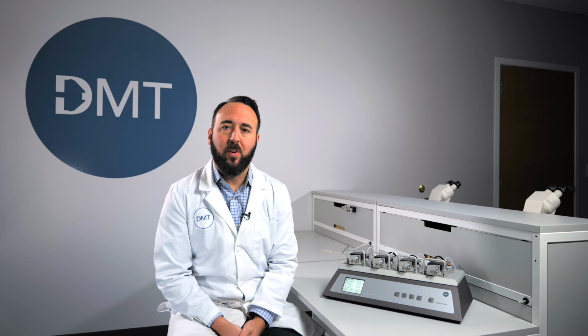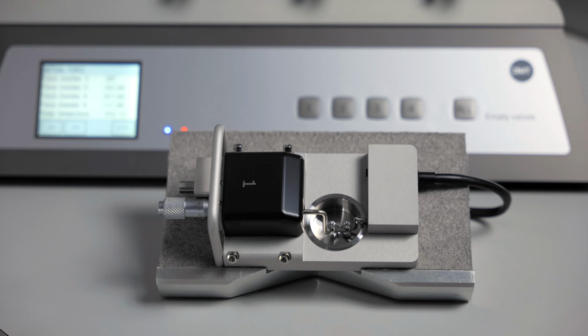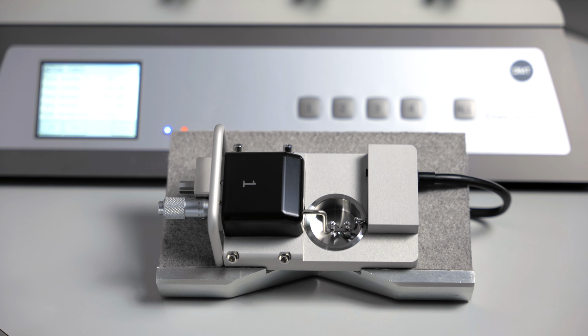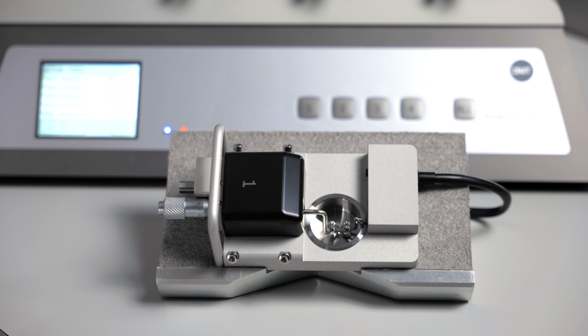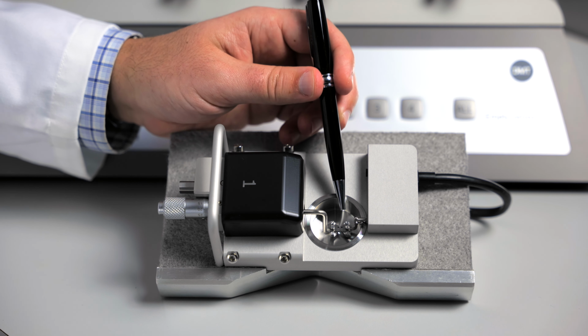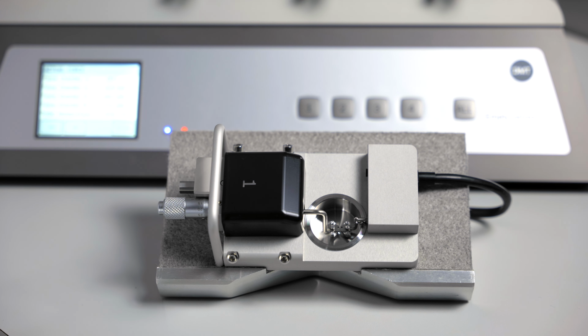It has the buttons on front for emptying the buffer in your chambers, as well as the touchscreen to control your temperature, perform your force calibrations, or change the sensitivity of the transducers. Each chamber has 2 mounts to which you will attach your tissue. One mount is connected to a micropositioner that will be used to stretch your tissue. The other mount is connected to the force transducer that will measure and record the forces exerted by your tissue.